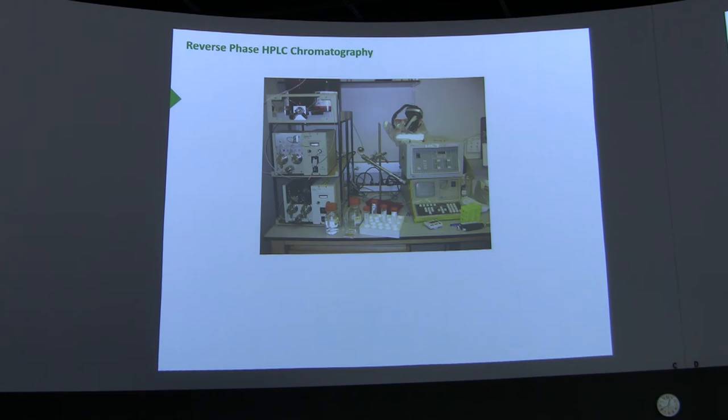The advantage of that is that the samples that pass through it have a lot more opportunity to interact with the material than when the beads are bigger. The smaller something gets, the higher its ratio of surface area to volume is. So these have very tiny beads packed very tightly. So to push samples through, we've got to have high pressure to do that.